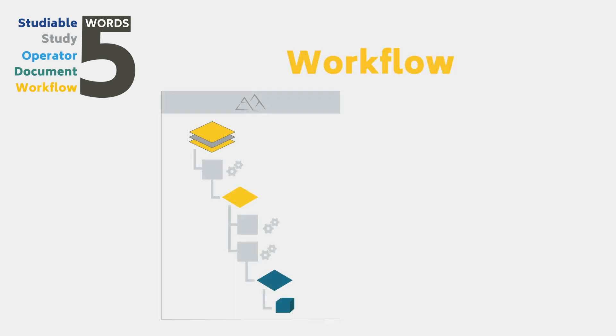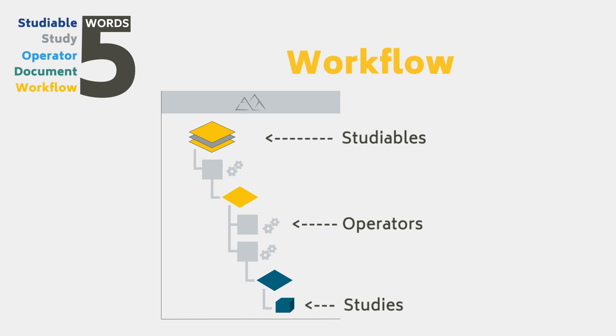The workflow is an interactive tree view of objects in the document, showing the relationship between studyables, operators, and studies.